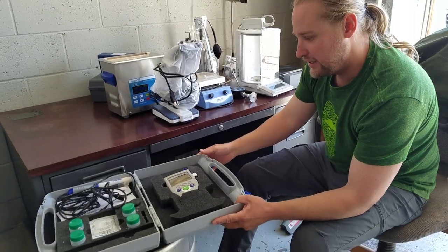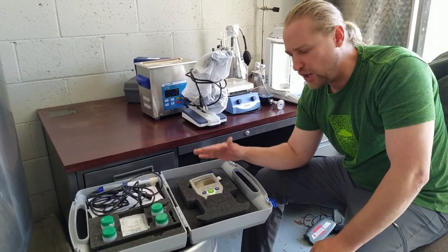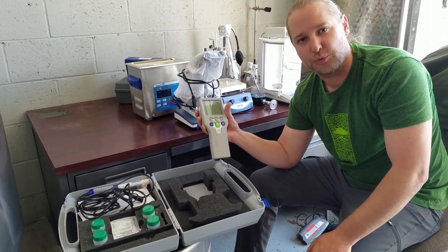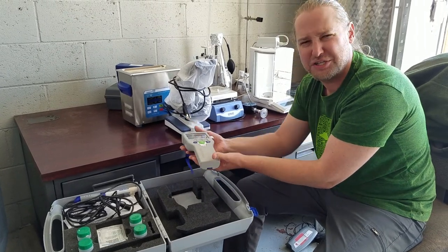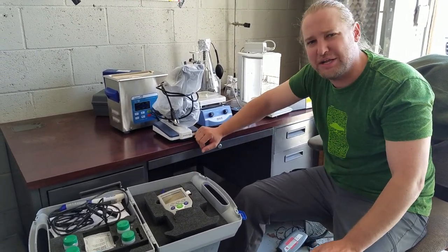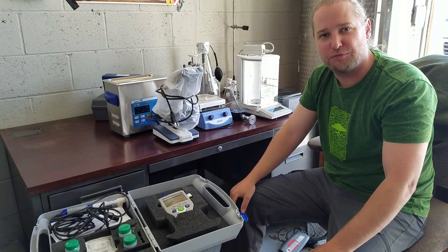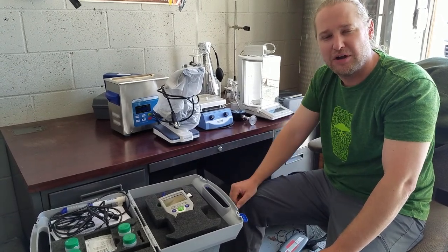Our last thing here is our Mettler Toledo Seven Go SG98 — our pH meter and dissolved oxygen meter combined. You can plug both probes into the top and read them. It's super nice to have an accurate pH meter in a brewery so you can make small adjustments with confidence. It's tough when you spend less than $500 on a pH meter. If you're a bigger packaging brewer, you'd also need a can piercer to punch a packaged can and pull a sample for the dissolved oxygen meter, plus a higher-end DO meter if you're sending beer all over the place.